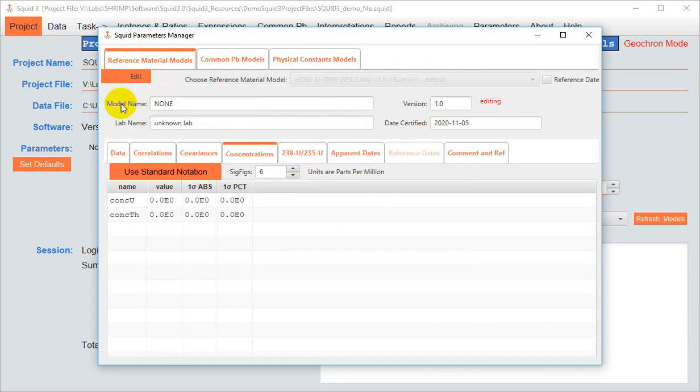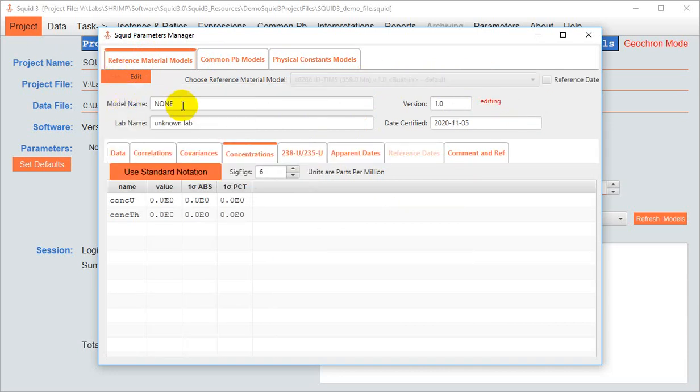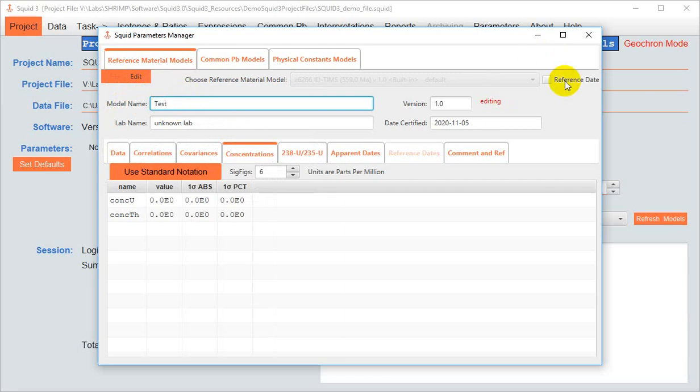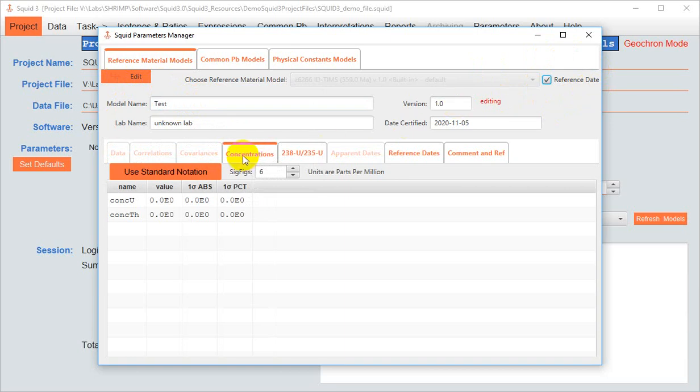For example, make a new empty reference model. We'll give it a name. For shrimp data, we often use reference dates, not ratios. If that's the case, for the new model you wish to make, you check this box here. Now you can go and enter your values.